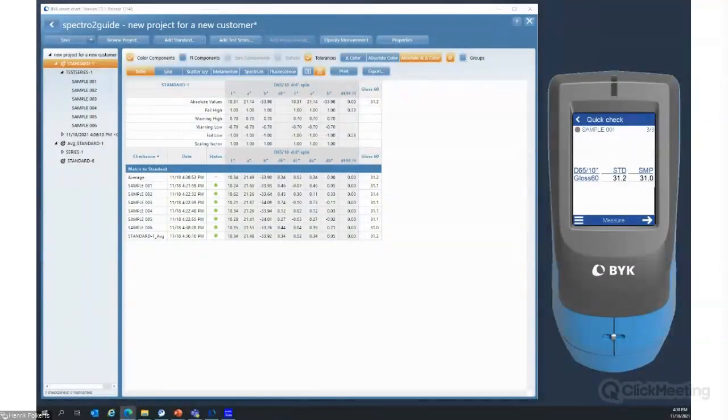Okay, now let's see what's left. So opacity measurement is also for a coming web seminar. Very important is the option properties. Now I have highlighted properties.